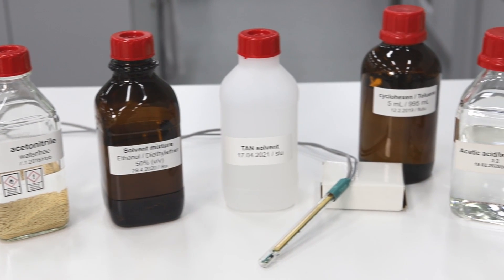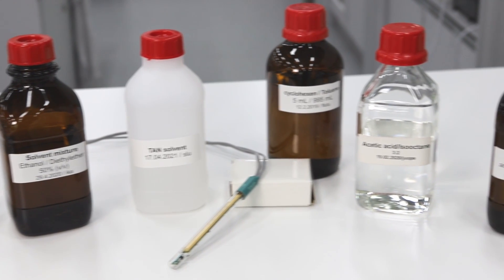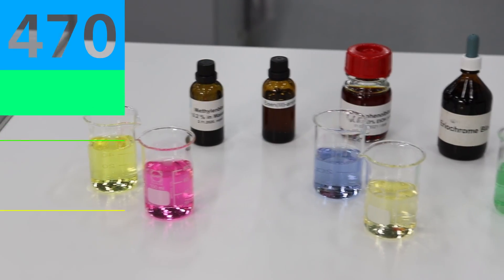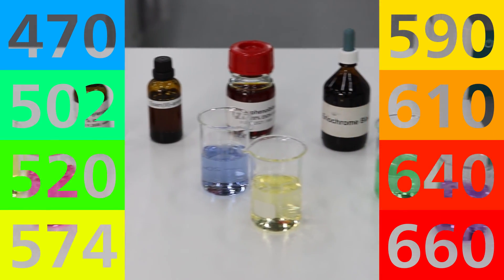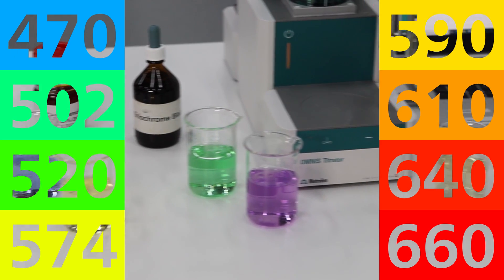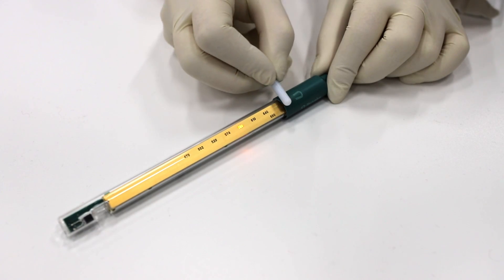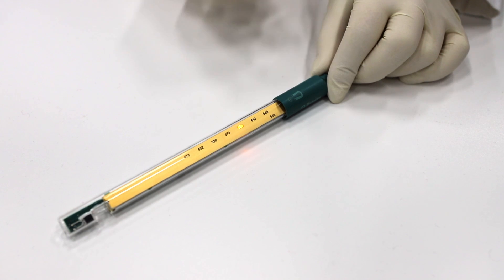You can even use solvents as the Optrode is made of glass and thus resistant to most kinds of chemicals. Different applications with different color changes are not a problem. You can choose from eight wavelengths over the whole visible light range. Simply change the wavelength using a magnetic steering bar.